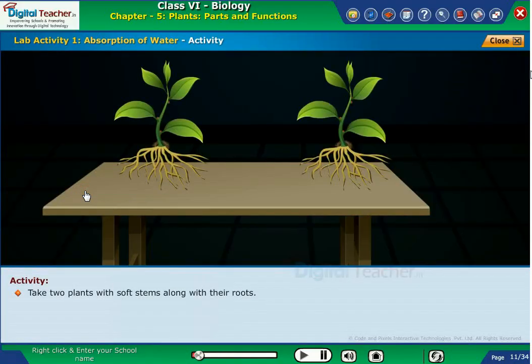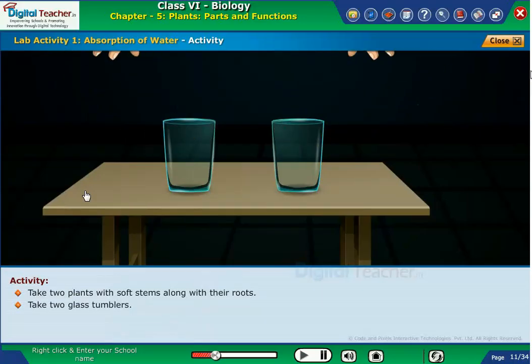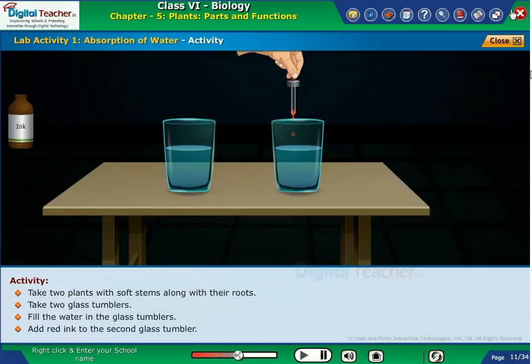Take two plants with soft stems along with their roots. Take two glass tumblers. Fill the water in the glass tumblers. Add red ink to the second glass tumbler.